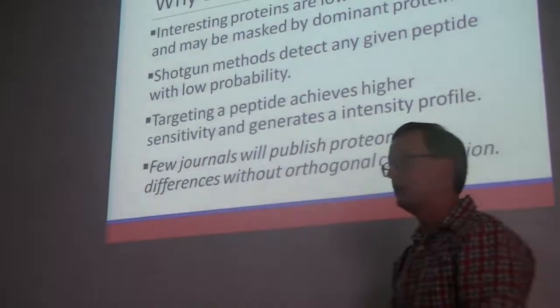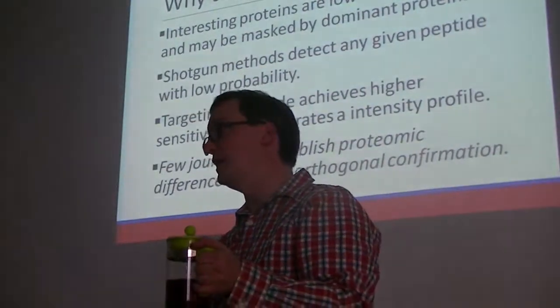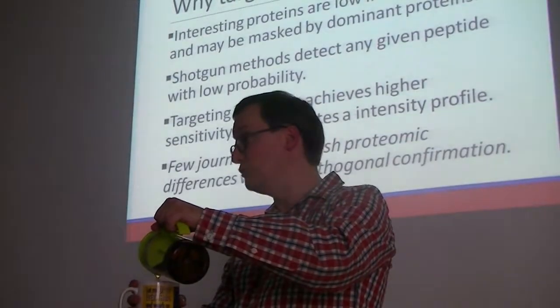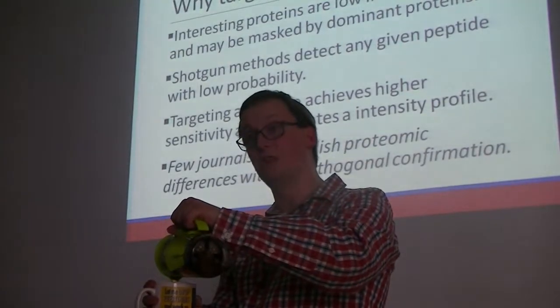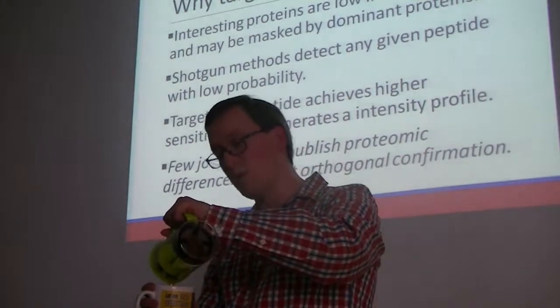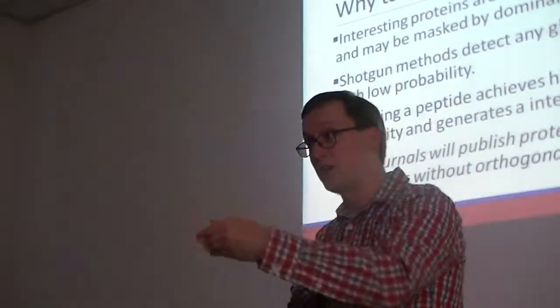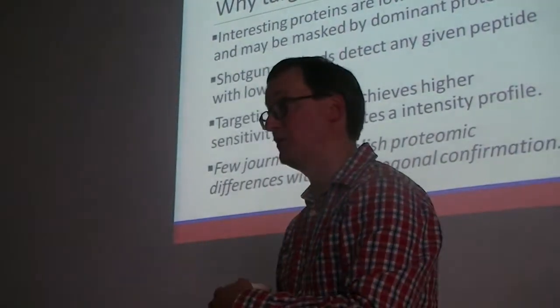Right now, if you do a really, really big proteomics shotgun experiment and try to publish it, you will very frequently find a journal saying, well, we don't want to publish that because we need orthogonal verification that these differences you found are real. They want to see you pull together a different cohort of samples, remeasure these proteins that you claimed were differential, and prove it. Prove that they're differential through quantitative proteomics. So lots of people now understand discovery proteomics is great, but they're learning through the publication process that they really need to have a subsequent quantitative experiment to publish.